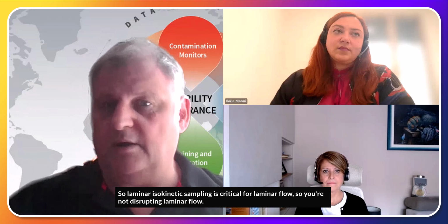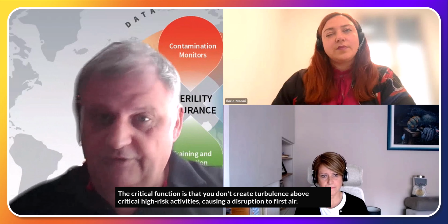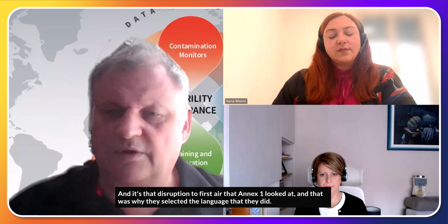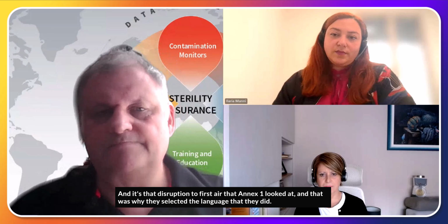So isokinetic sampling is critical for laminar flow, so you're not disrupting laminar flow. But in unidirectional airflow, and certainly first air, it's not a critical function. The critical function is that you don't create turbulence above critical high-risk activities, causing a disruption to first air. And it's that disruption to first air that Annex 1 looked at and went, and that was why they selected the language that they did.